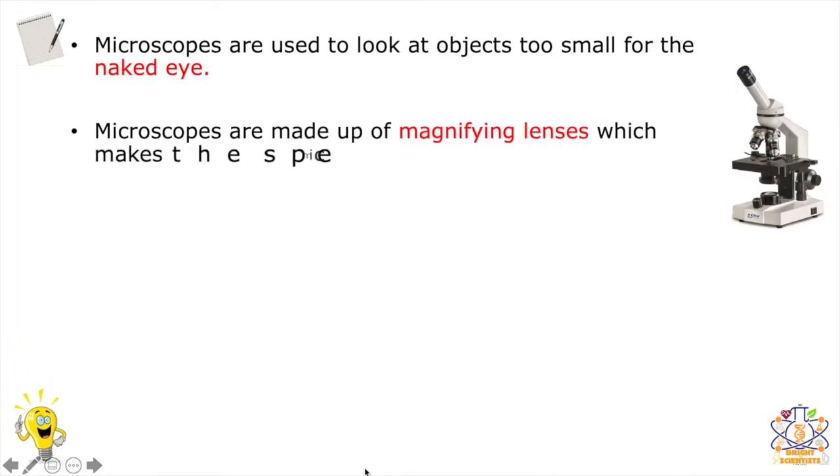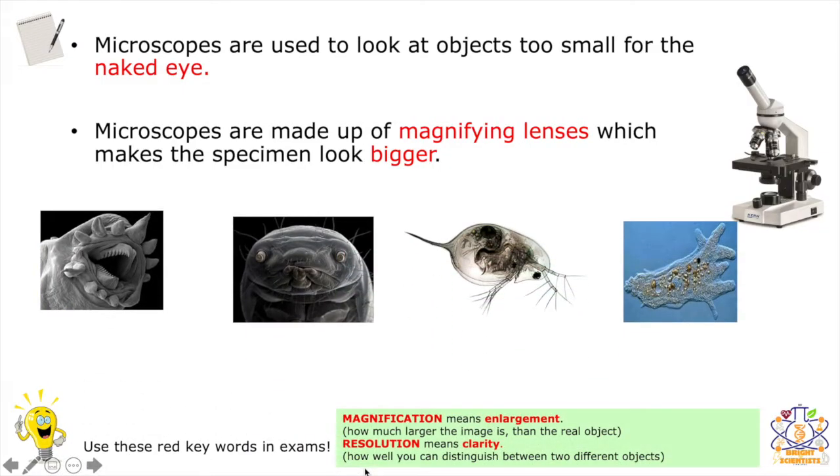Over here you can see that there are images of different organisms under a microscope. We have the hydrothermal worms, the mealworms, which are used to magnify their faces and reveal its eyes and mouth parts really clearly. They are the larval form of the mealworm beetle and are commonly used as high-protein feed for animals. The next image is the breeding Daphnia, often used at A-level biology to look at their heart rate, as you can see the structures clearly under a microscope, and also amoeba.